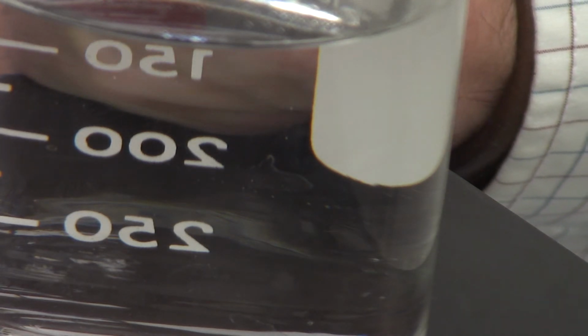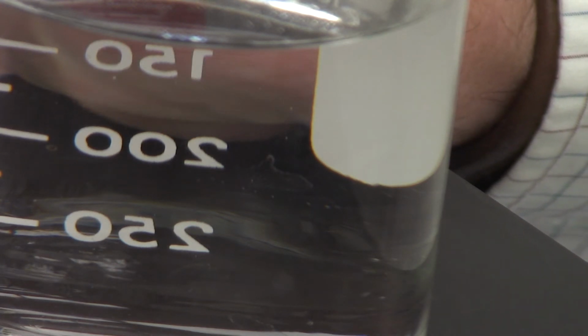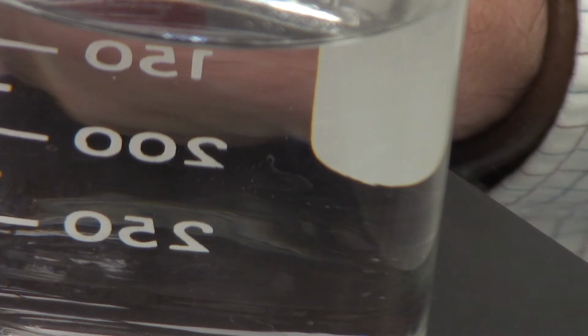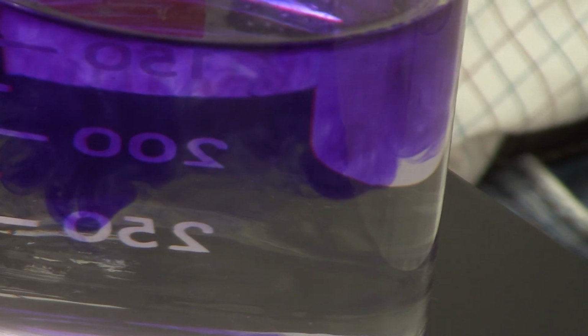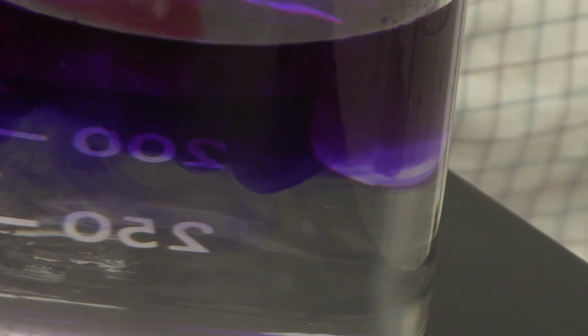So, okay, we're going to take 0.25. Hold on. The hard part about this is that it's really tough to see. Okay. All right, so now we'll put this in here. By the way, this is a god-awful stain on your clothes. So that was just one drop. And we'll go ahead and add all that in.